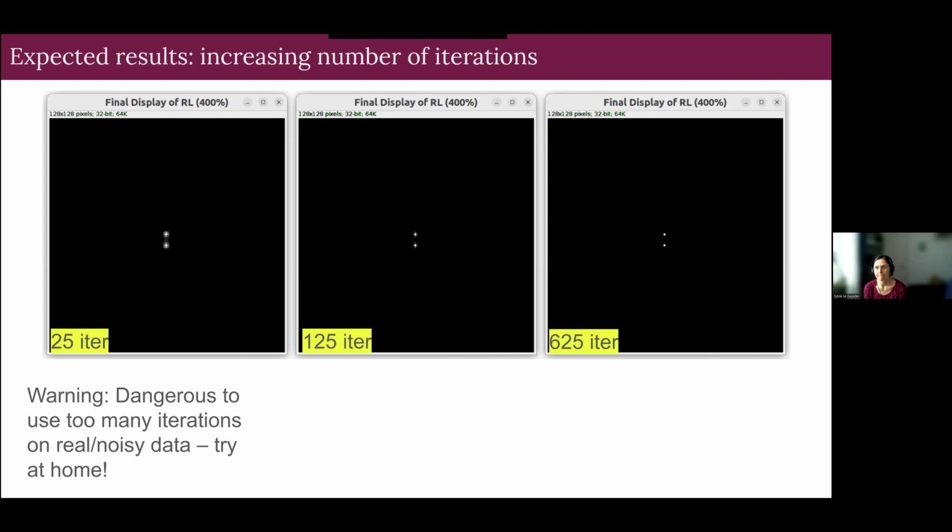And if you go through this supplementary, you will see that it's actually a noise filtering step before using Richardson-Lucy, or alternatively the Landweber model if it's not that noisy. So there is an advantage, but it makes things a little trickier to interpret. And of course, there's a great benefit if you correct for problems if there's a CCD detector. You have to characterize each pixel, or if it's CMOS, you will correct for a bias in the columns, for example. So those things should be done before deconvolution.